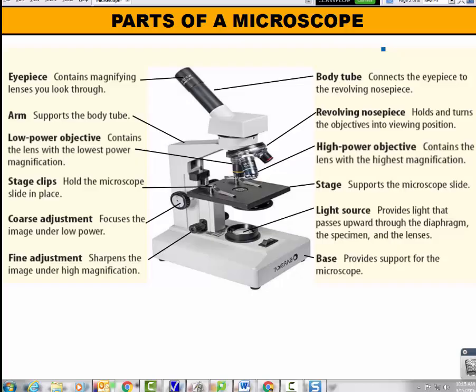And there you have it, ladies and gentlemen. Those are the different parts of the microscope, and that's how you go about focusing an image on the microscope. Thank you for your time, and I hope you found that helpful.